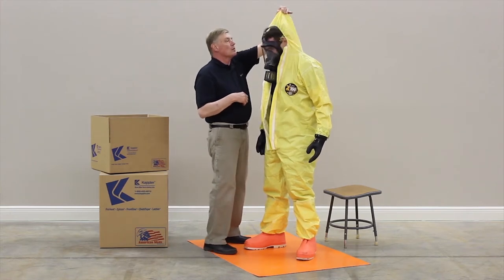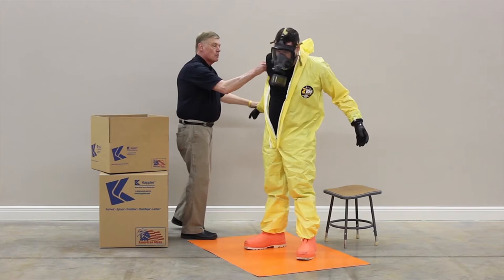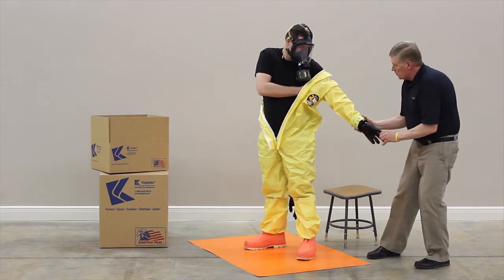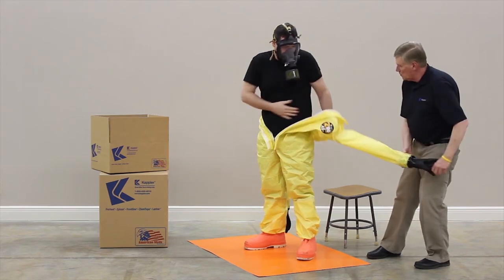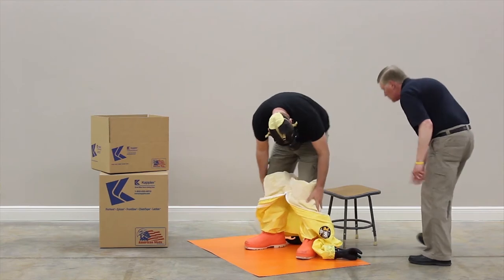Remove the hood and work each arm out of the garment. Use caution to prevent the wearer from touching the outside of the garment. Lower the garment below the hips and have the wearer sit down.